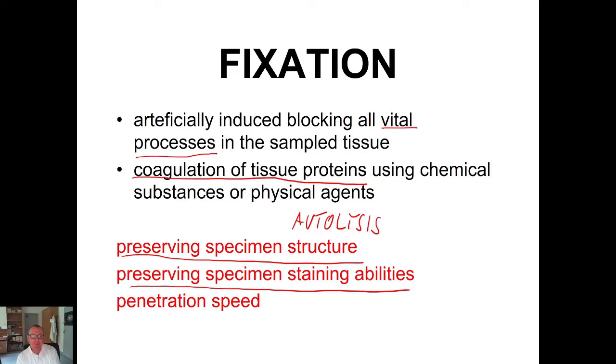Important is the penetration speed. Some fixatives penetrate quickly into the tissue. Some are slower. So that's the thing the laboratory staff has to know to adjust the size of the specimen and so on.